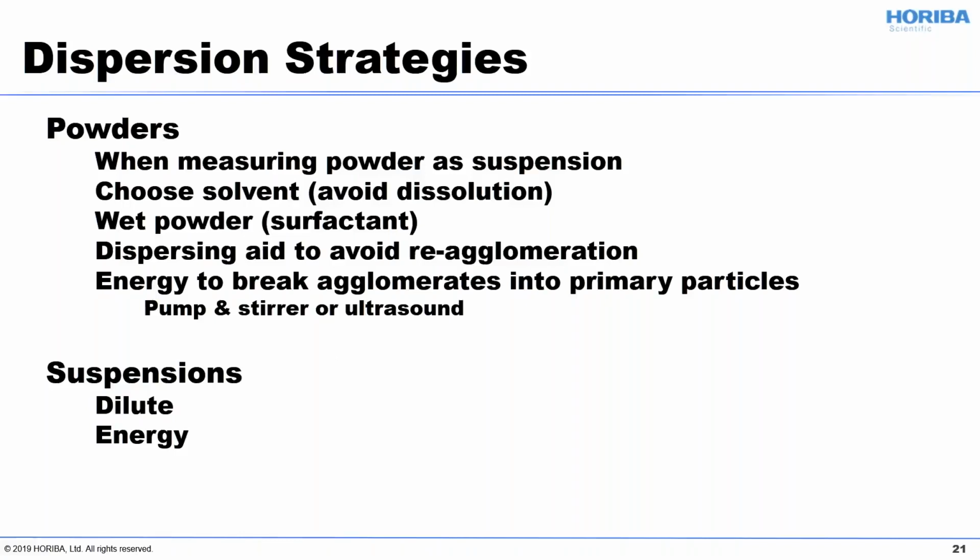Now, this looks very much like formulation, and it is really kind of a formulation question. The great mercy is that when I make a formulation or a suspension, I only need to worry about it being stable for 30 minutes to an hour. So it's not like someone who's making a formulation for actual consumer work where you say, hey, I need this formulation stable for months. Nah, if it's stable for an hour, I can declare victory and move on.